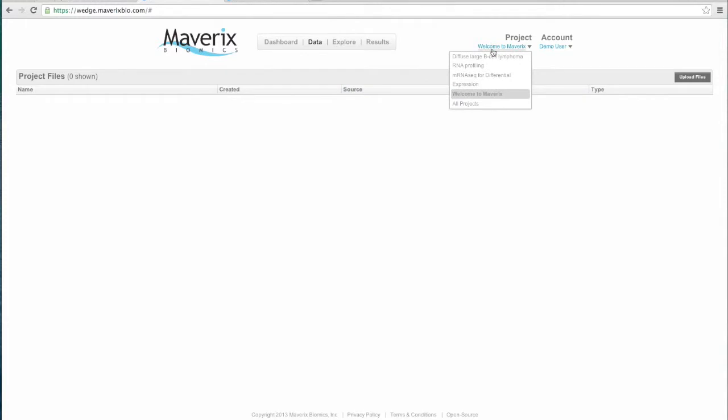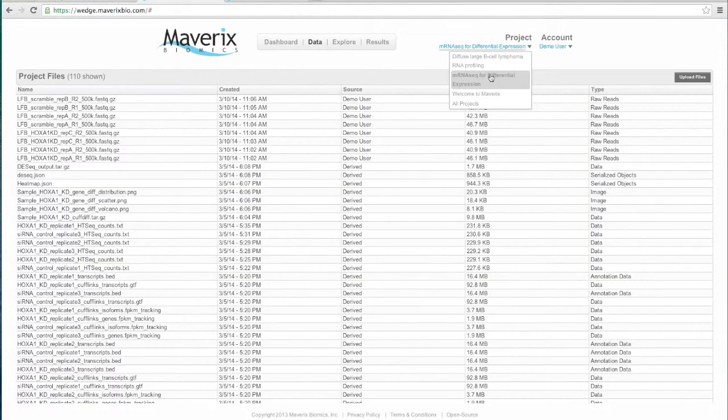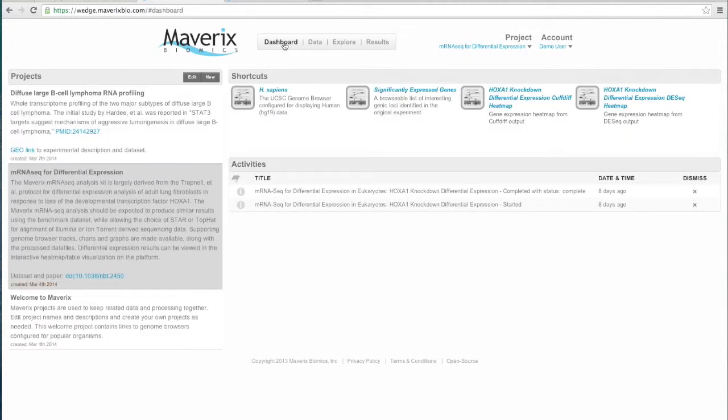This Welcome project doesn't have any files associated with it, whereas this mRNA-seq project here actually has files that were uploaded by the user, as well as those that were derived from the analyses that were run while they were using that particular project. So if I come back to the dashboard, you can see, as I said at the top, you have these different tabs here that we can move through, and I'll show you. But I wanted to show you one other quick thing from here.